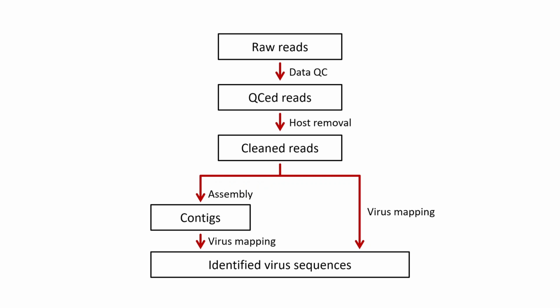And that wraps up our tutorial. I hope you found it helpful in learning how we can identify viruses from NGS data using Galaxy. Remember to keep exploring and experimenting with different tools and settings. Science is all about curiosity and discovery, and with tools like Galaxy, there's so much we can learn.